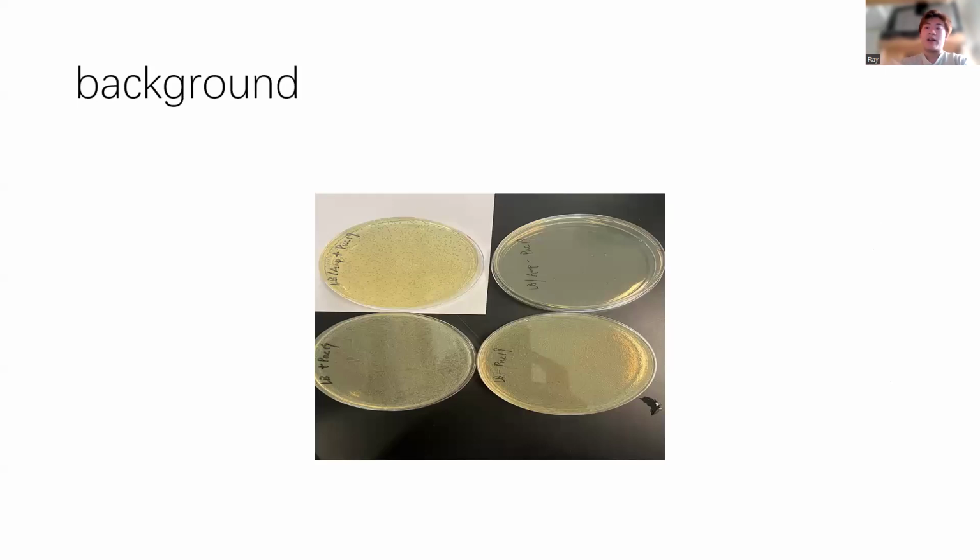The background is an experiment we've been doing in class. It's about bacterial transformation, as shown in the result on the screen. In the plus plasmid condition, competent E. coli bacteria were exposed to the pUC19 plasmid containing the ampicillin resistance gene. We observed robust bacterial growth on both LB-AMP plus pUC19 and LB plus pUC19 agar plates. This figure illustrates this growth.